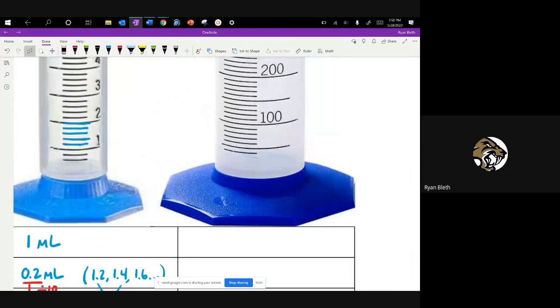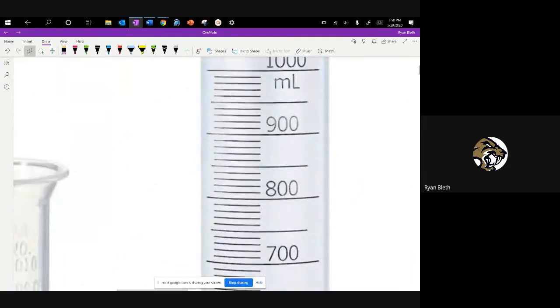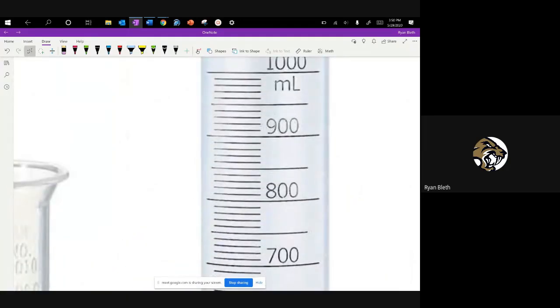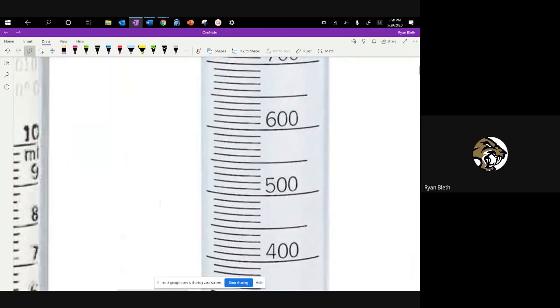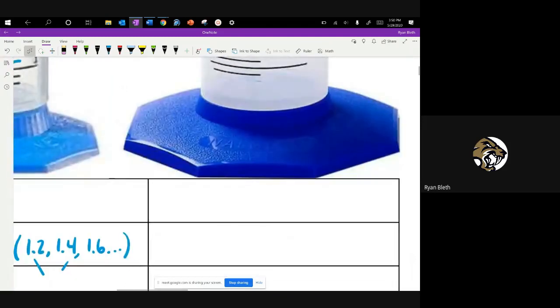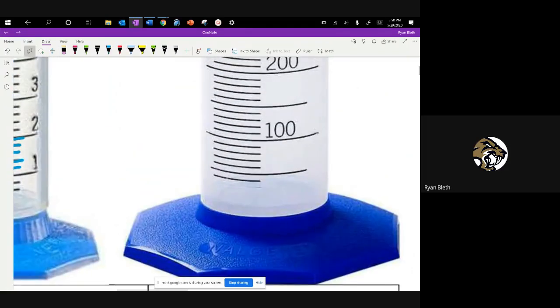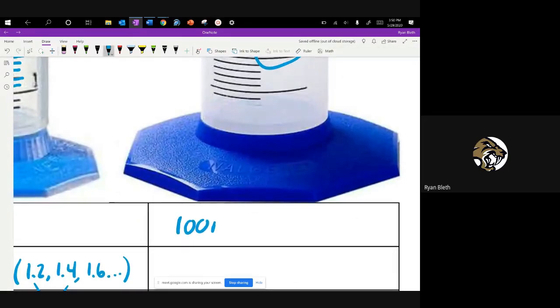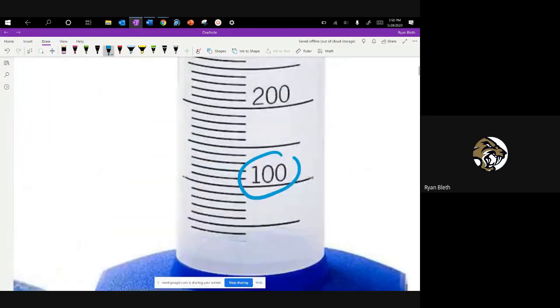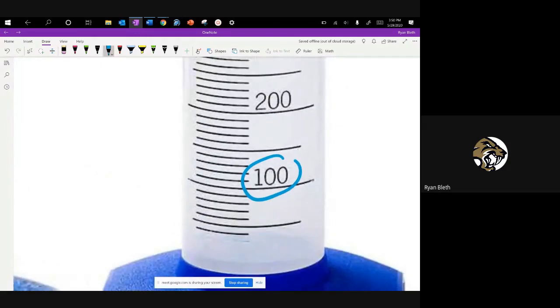On this device — a 1,000 milliliter graduated cylinder — these are quite long, as long as my forearm if not longer, all the way up to 1,000 milliliters, so this can measure out to a liter. We've used this for preparing large volumes of solutions. This has got major markings for every hundred milliliters. The minor divisions — if I look here between 100 and 200 — there are lines for every ten: 110, 120, 130, 140, 150, and so forth.